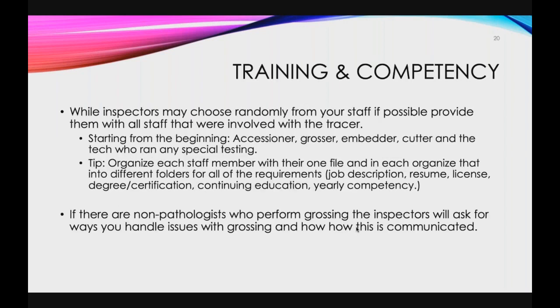For training and competency. While inspectors may choose randomly from your staff, if possible, provide them with all staff that were involved with the tracer.